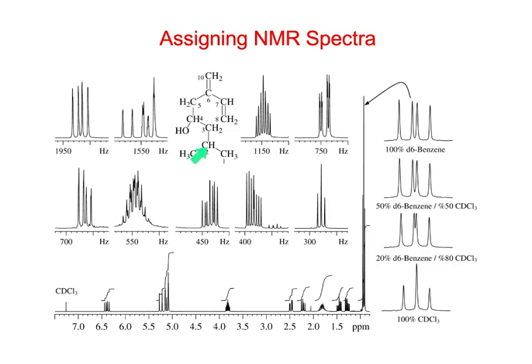This one here? The middle proton. Well, it would be a septet from these two methyl groups. But there's another CH2 over here, and in fact, that CH2 is next to a chiral center. So these are going to be diastereotopic. So this would be like a doublet of septets or something like that. Yeah. Or a multiplet. That's what I like.